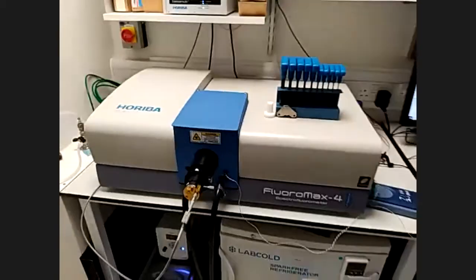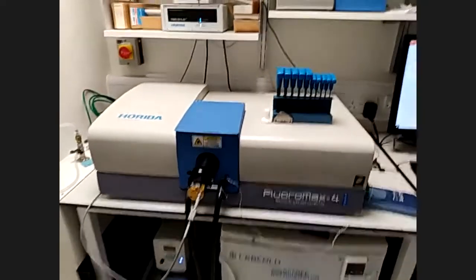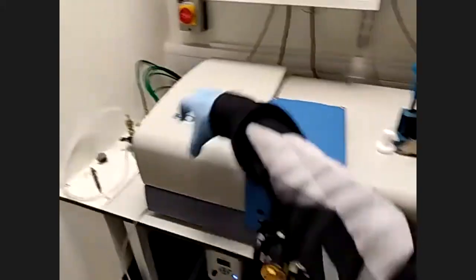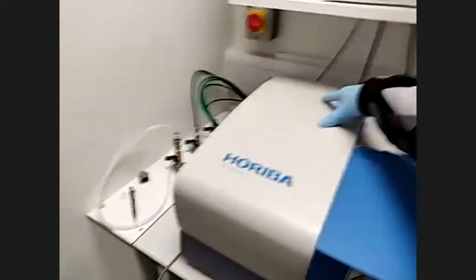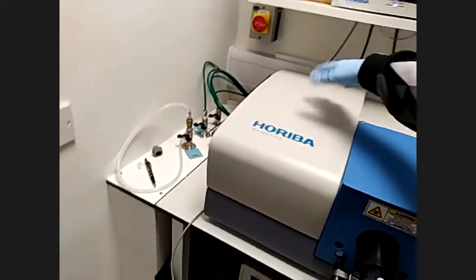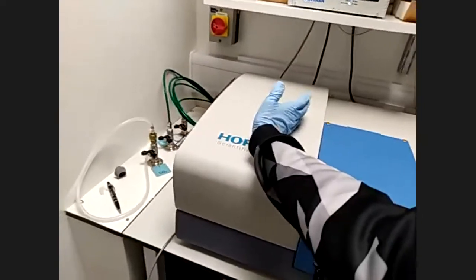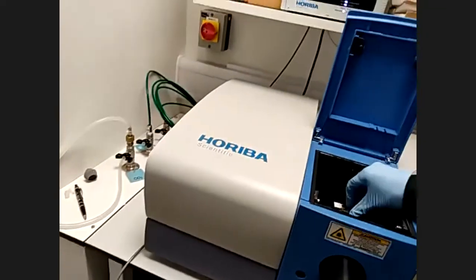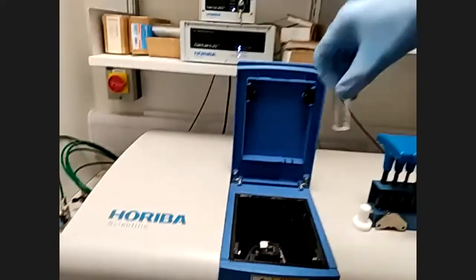In the first instance, we're going to use this fluorescence spectrometer. This is a device that has, if you imagine, a light source inside the box. I'm not going to take the box off because it's kind of dangerous, but a white light source, and then a prism that allows you to select what kind of light you want to throw in, and then I've got in here a sample.